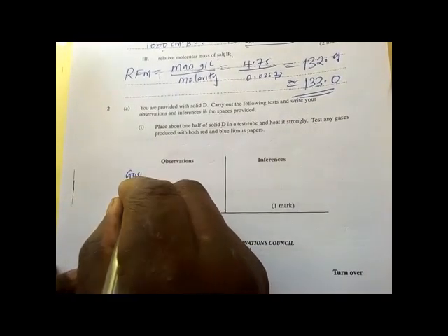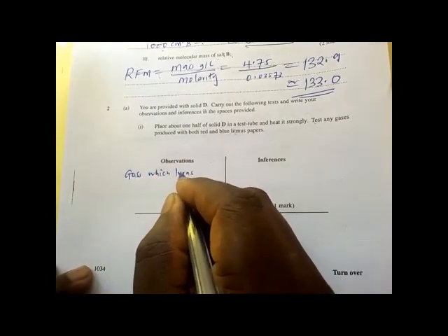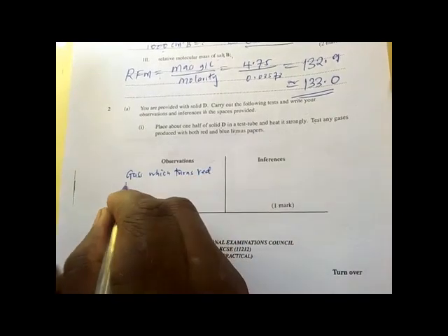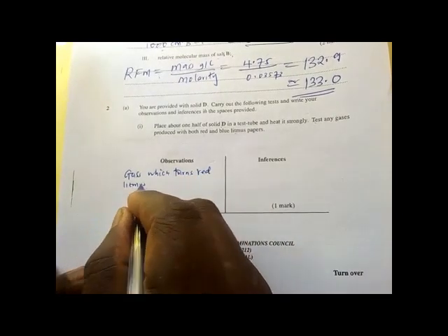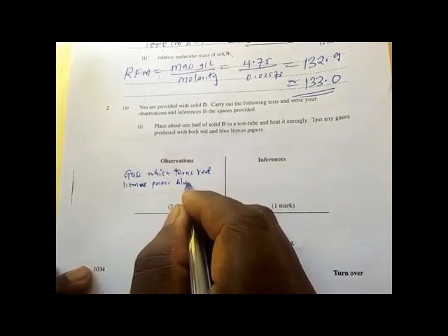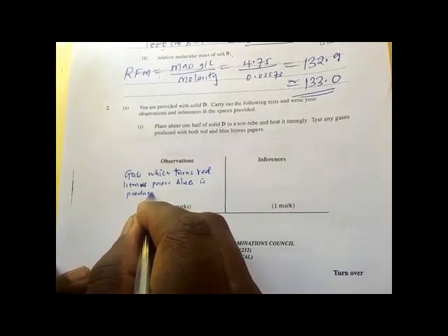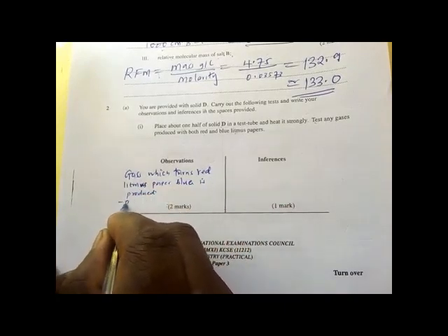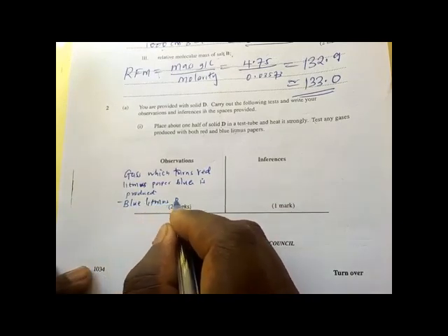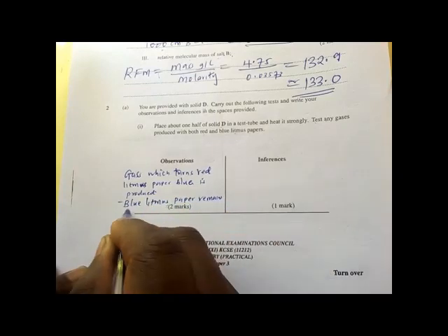Gas which turns red litmus paper blue is produced. The blue litmus paper remains blue.